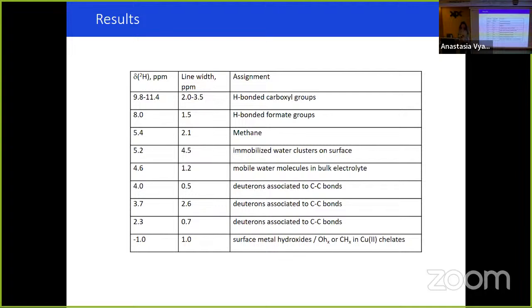Maybe last question. The electrochemistry part is very interesting. I didn't get why you looked at the deuterium resonance and not at the proton, for example. And the second question is sensitivity, because NMR suffers from sensitivity. You could do spectral electrochemistry with UV-Vis or infrared, and probably get similar information. NMR can give you structure, but you need a high concentration of analyte to see the resonances.